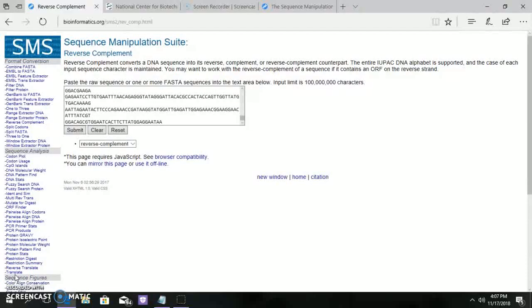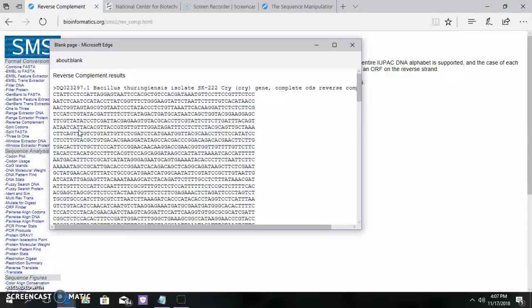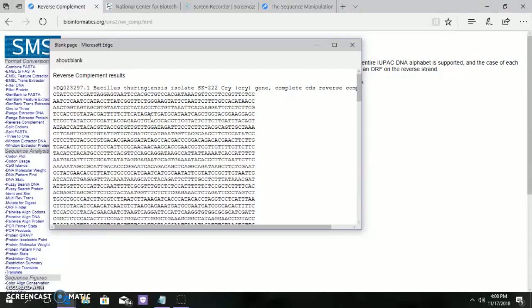Now about the reverse complement. In reverse complement, the DNA sequence is reverted and then it gives the complementary sequence. Reverse complement of the sequence is formed by reversing the letters, interchanging A and T, and interchanging C and G.